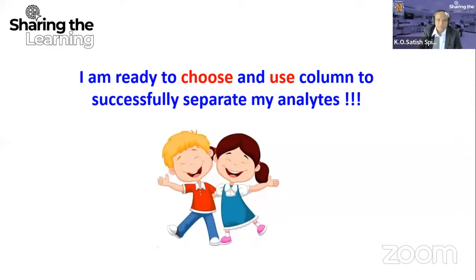Yes. So for the separation of phenols, which column should be used? This is a query from Mr. Khaja Moinuddin. You can use a normal C18 column. I don't know what other functional groups are present in the phenyl column, but a C18 column should do the job. That should not be a problem.